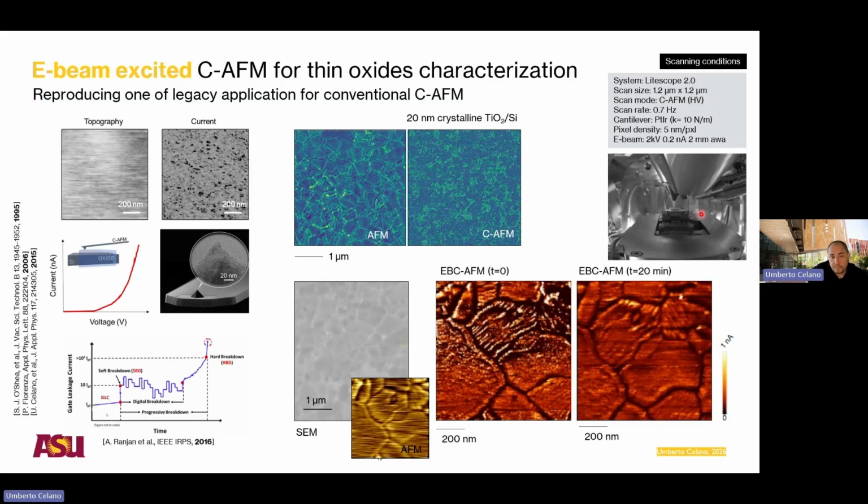So that means that our charges are injected inside the substrate and then collected through the probe point per point across the surface of the titanium oxide. And you know, the most simple demonstration for that is that we would not have any sort of spatial resolution for our contrast if that wasn't the case.